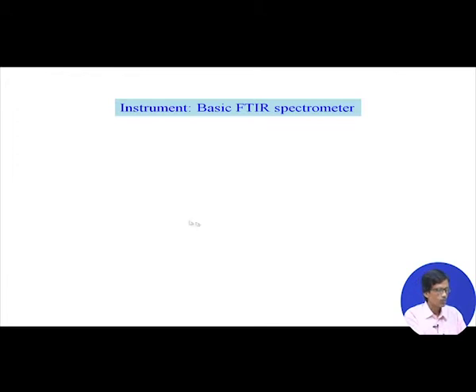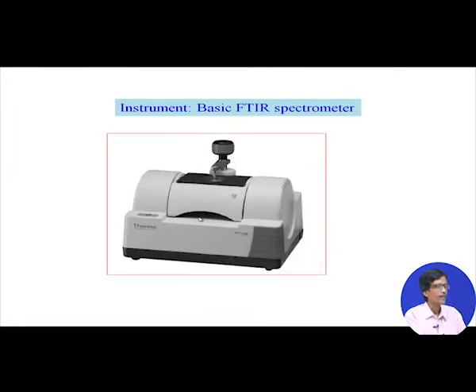So, the basic instrument available in all these laboratories is like this. This is from the Thermo Fisher company, who has given us this particular type of instrument. This model is a very small one nowadays, and we consider it benchtop also, and we can use it in different types of laboratory analysis.